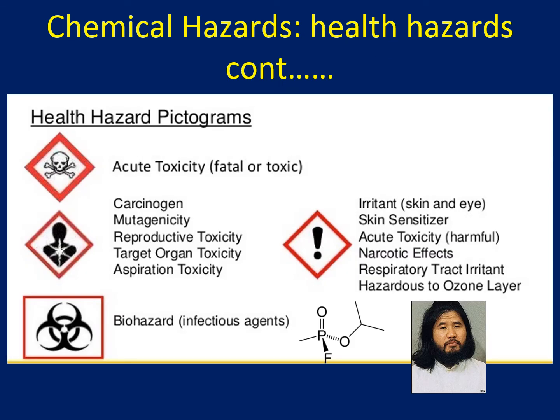For the health hazards, most of the time you can see symbols like acute toxicity. That means it can be fatal. We have the skull and crossbone, which I have already explained. And for carcinogenic material, that is a cancer-hazardous material, so you can see this kind of symbol on some bottles. And biohazardous, most labs working with viruses and bacteria post this symbol on the door. So you need to be very careful about these biohazard symbols.